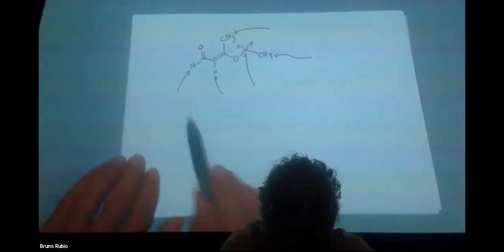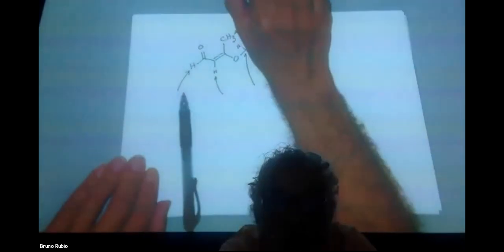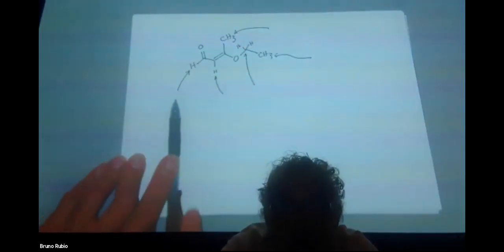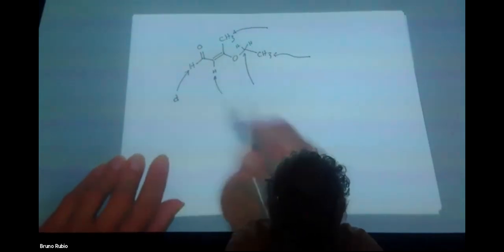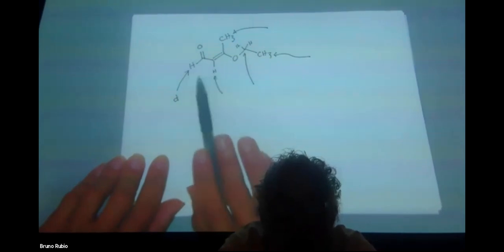Okay, so let's go with this guy here. What's going to be the splitting of this guy here? I need a word that ends in "et." Tell me in the chat. This proton right here, what's its splitting pattern going to be? We're thinking about n+1 splitting. All right, it's going to be a doublet, right? Because there's another proton 3 bonds away, and these 2 protons aren't equivalent to each other. N equals 1, 1 plus 1 is 2.